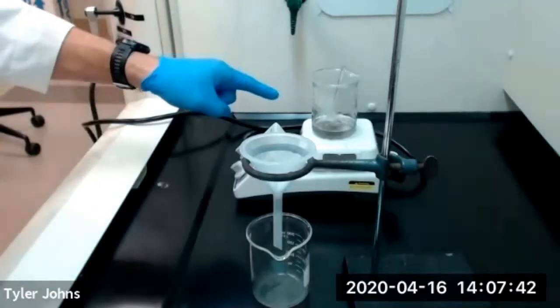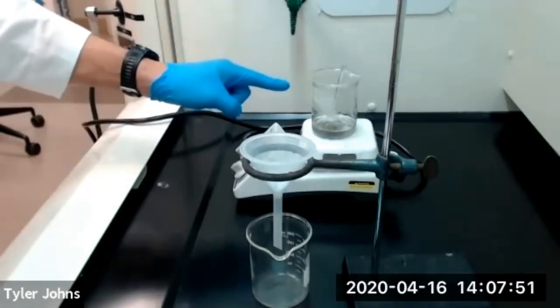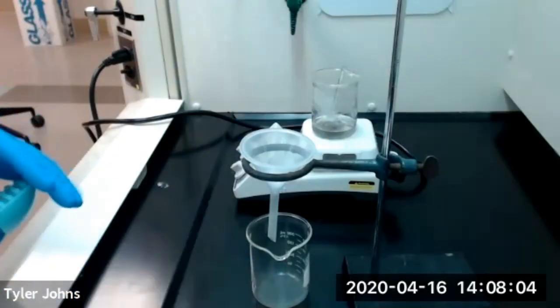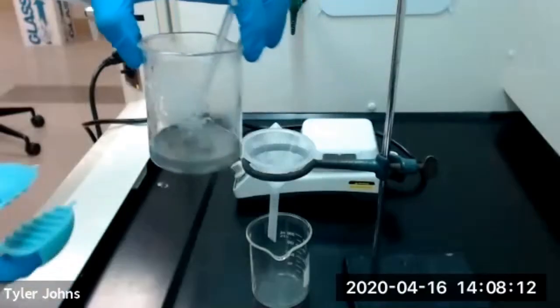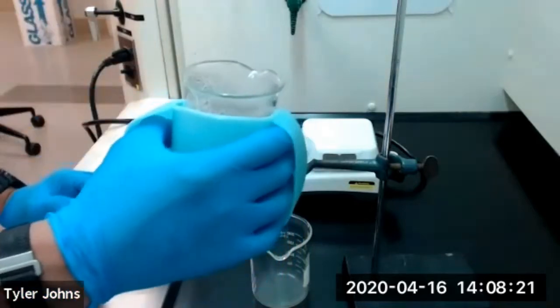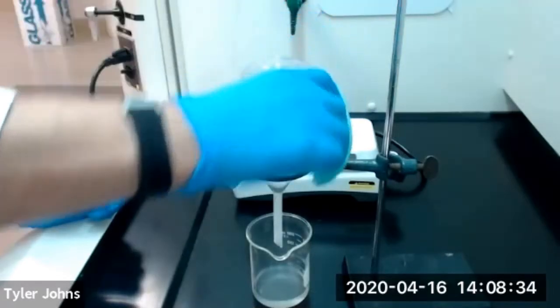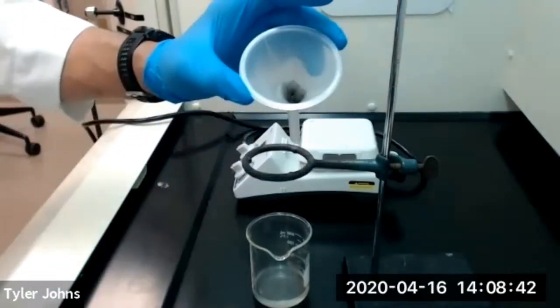Okay, so at this point, we've boiled our aluminum plus potassium hydroxide mixture until we reduce the volume by about 25% or so. So we're going to take that now off the heat and we're going to transfer it into a funnel with some glass wool inside of it. And that glass wool is going to catch any impurities that are in our aluminum potassium hydroxide mixture, which you can see there are some impurities inside there. We're going to remove the glass stir rod and use some hot hands and transfer the solution into the funnel. You can see we captured a lot of those impurities in our glass wool.